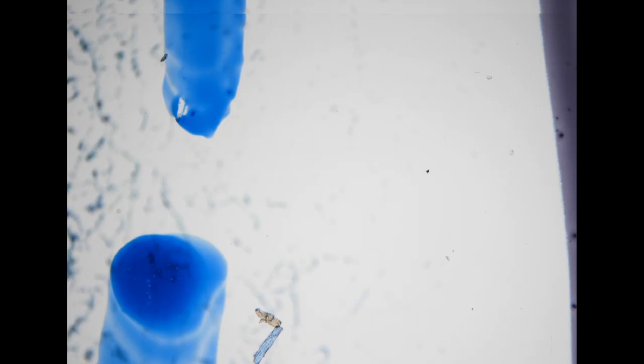So the next specimen is a peritoneal washing cytology obtained during the operation for ovarian cancer. The patient is a 43-year-old female.